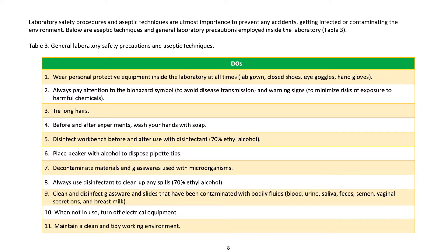5) Disinfect workbench before and after use with disinfectant — 70% ethyl alcohol. 6) Place beaker with alcohol to dispose of pipette tips. 7) Decontaminate materials and glassware used with microorganisms. 8) Always use disinfectant to clean up any spills with 70% ethyl alcohol. 9) Clean and disinfect glassware and slides that have been contaminated with bodily fluids such as blood, urine, saliva, feces, semen, vaginal secretions, and breast milk. 10) When not in use, turn off electrical equipment. 11) Maintain a clean and tidy working environment.